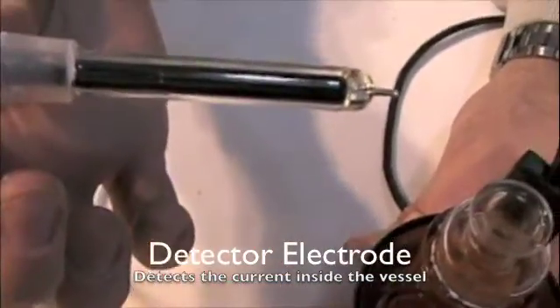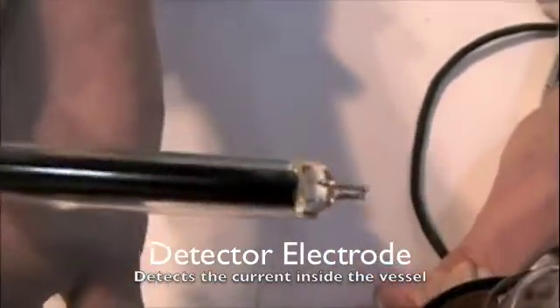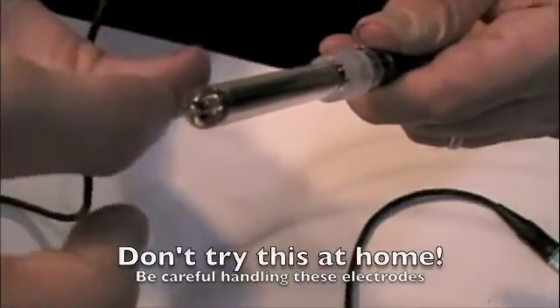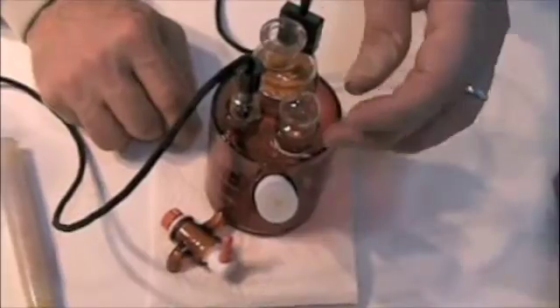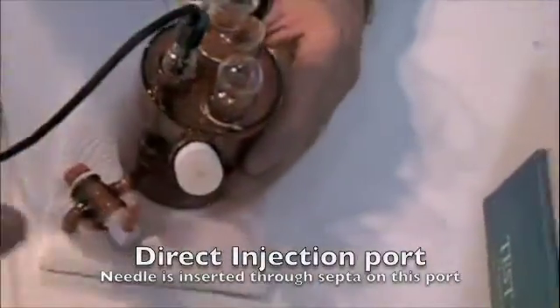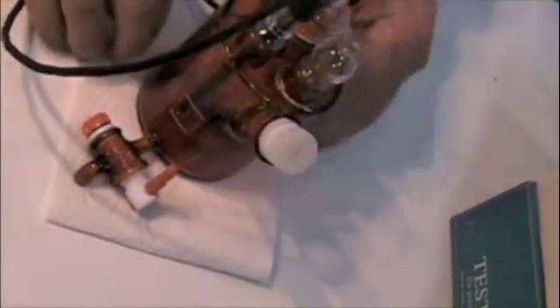You can see the two prongs on the detector electrode — they should be apart. We also have a port here, and this is the port for doing your manual injection. So that's your generator and your vessel.